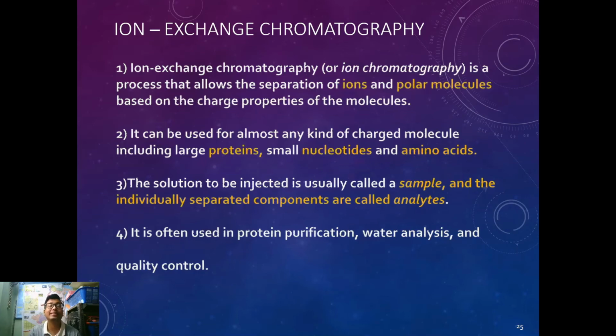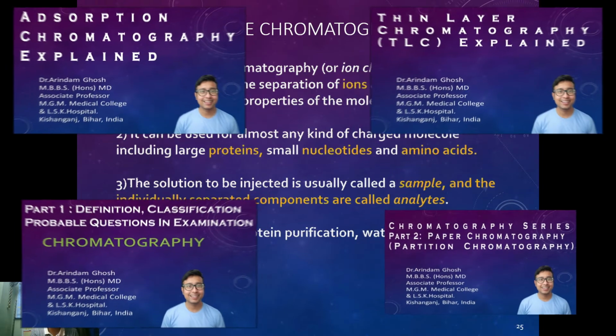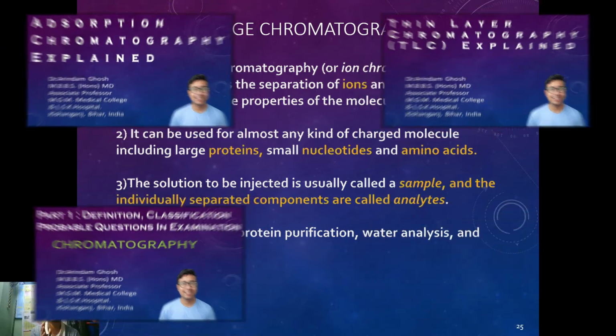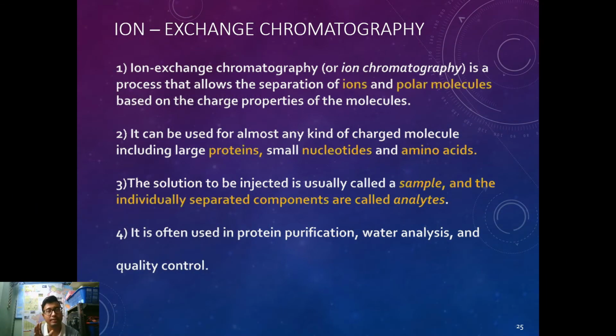Welcome back, students. In this lecture, we'll be covering ion exchange chromatography. Make sure you view the earlier lectures on adsorption chromatography, thin layer chromatography, and paper chromatography. Now, ion exchange chromatography is very interesting and rather easy to understand because most of us have studied purification of water. Over there you already read about ion exchange resins. The same thing is utilized over here.